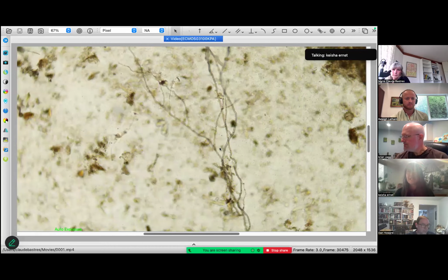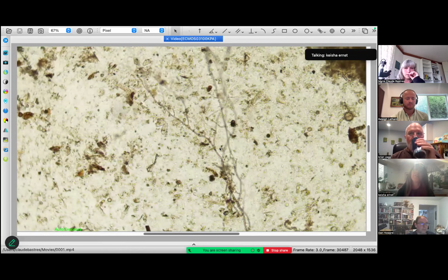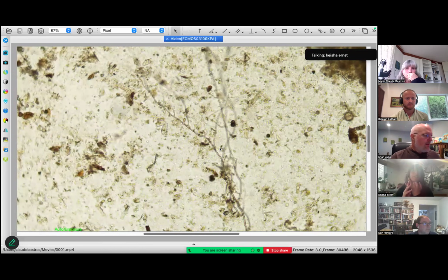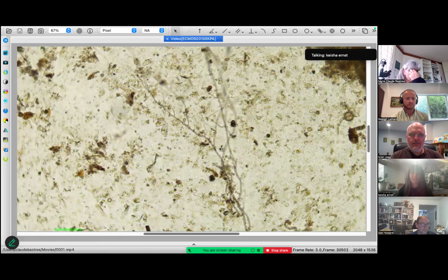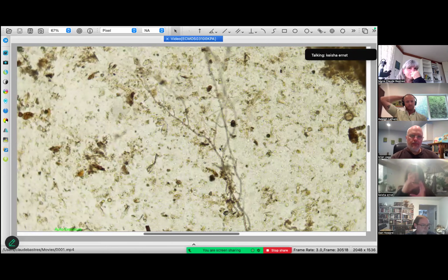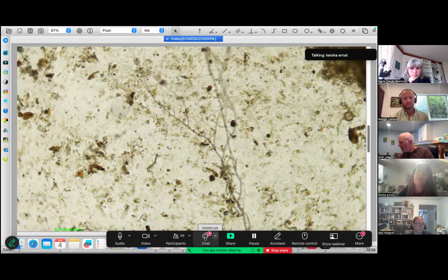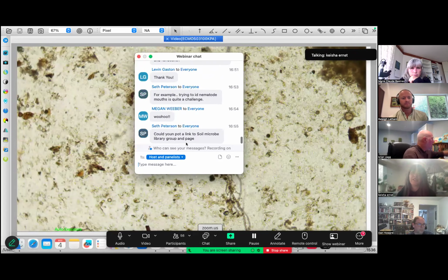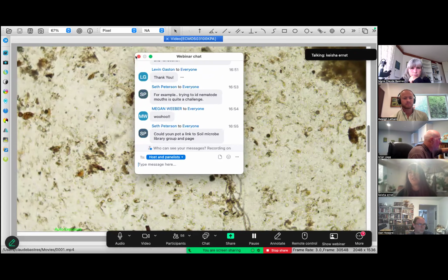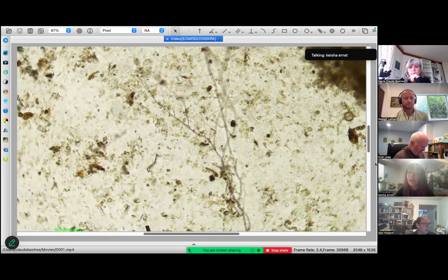On Facebook there's probably 5 or 6 thousand people, maybe there was like 5,000 a few years ago. A lot of them are Soil Food Web students or they work with KNF, they work with microscopes. Everybody there's a microscope nerd. They share photos, they share images, and we all commune and talk about what we're seeing. And on Instagram, there's a page as well called Soil Microbe Library. It's a little bit different in that people send me images that they don't know what they are, and then I share them and talk about them. There's a huge history on both of those. You can just cruise through and look. But there's a lot of other really nice pages as well.